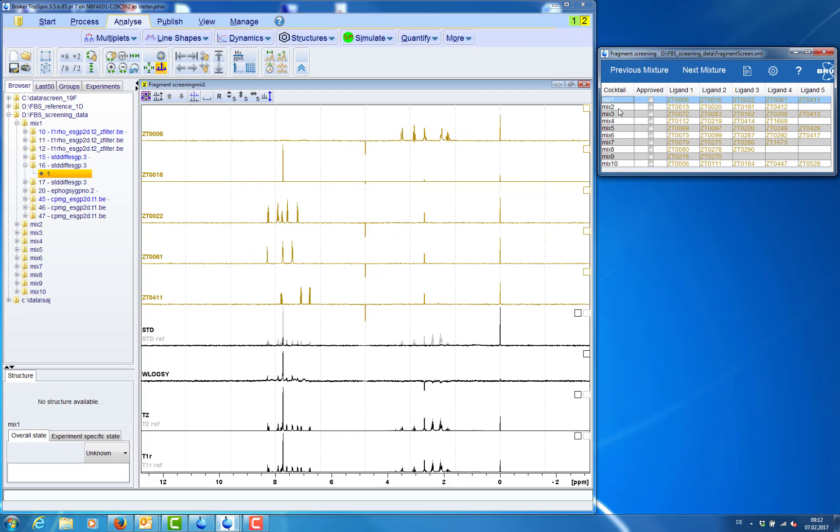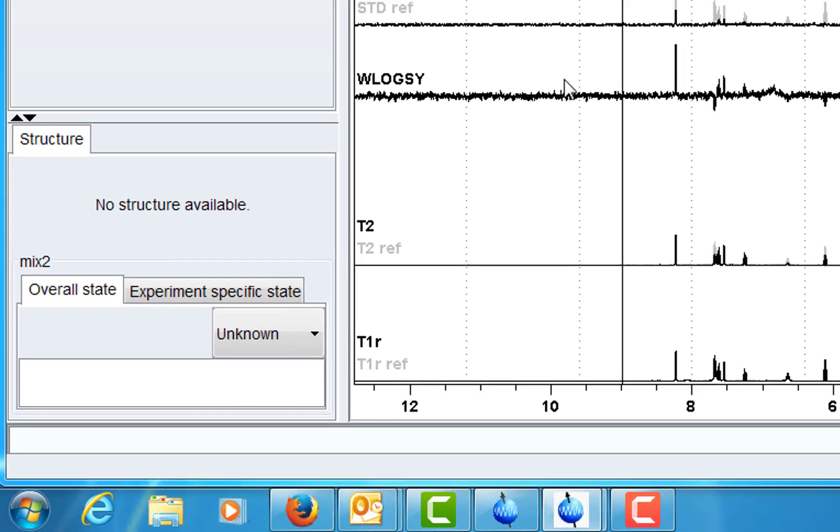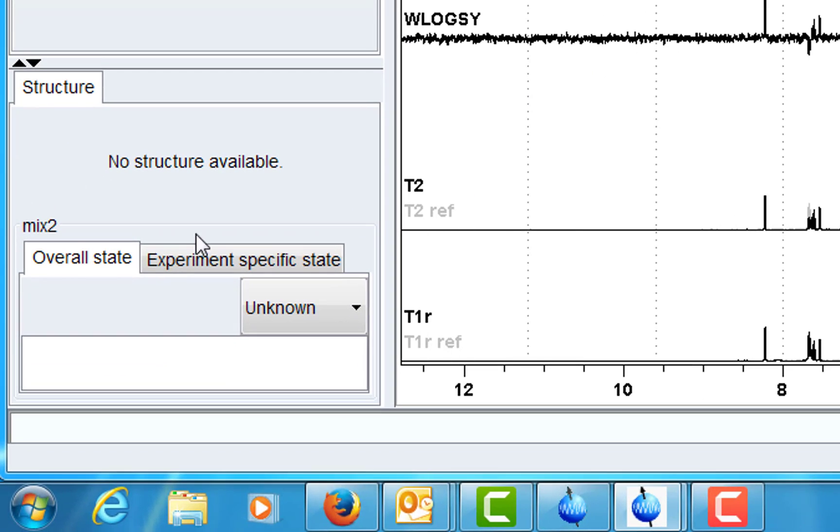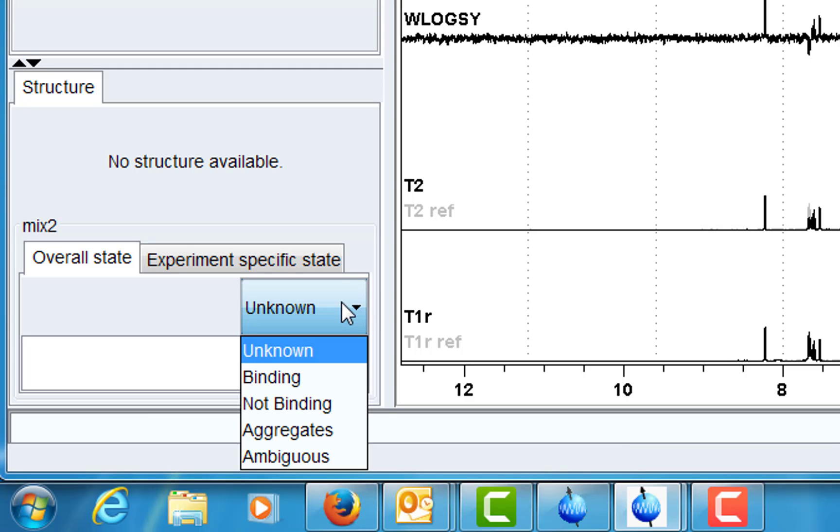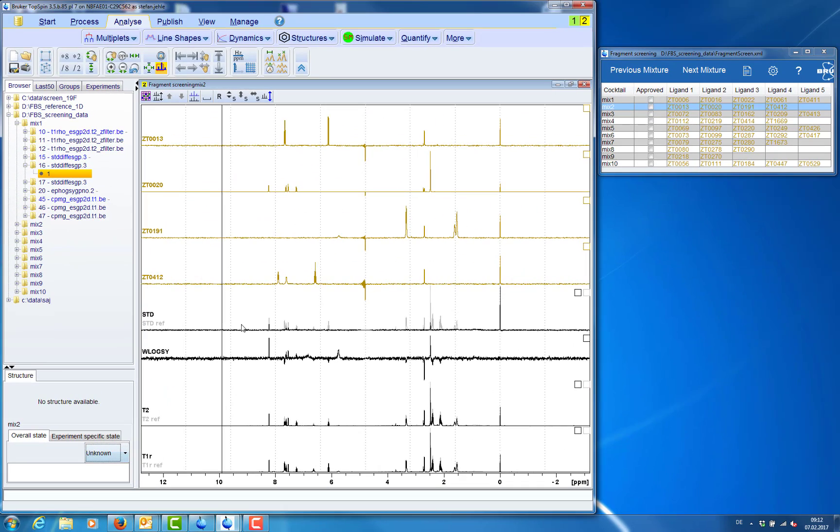When analyzing screening data we can annotate on several levels. So if we select the mixture itself it will be shown there and we can annotate the mixture. For example if something is binding in this mixture.